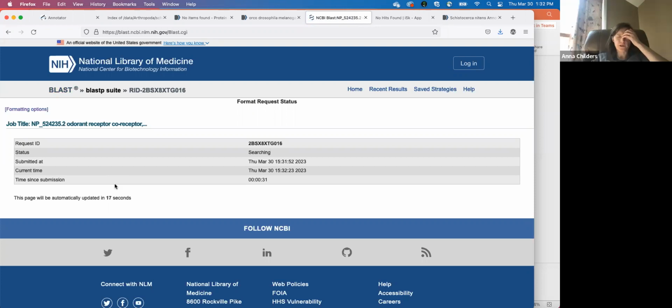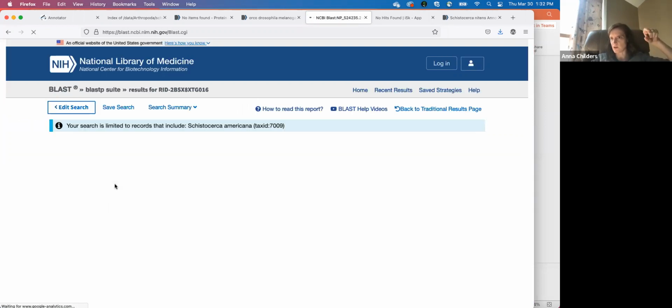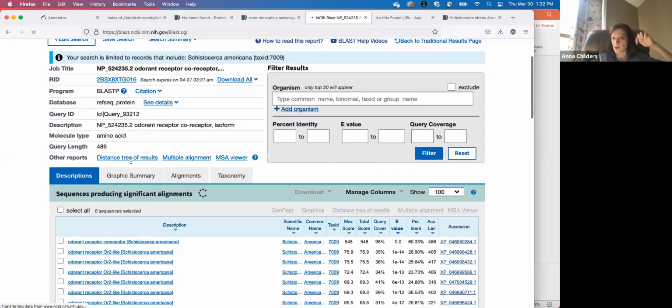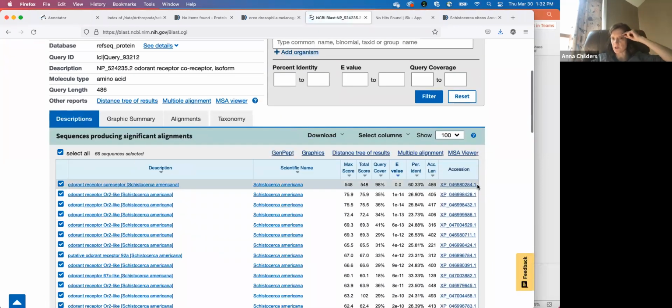So Monica, just to be clear, you're only saying that we can't do it at the I5K workspace because of the fact that it needs to be reset, but after that's reset, we could be doing this there, putting the transcript sequence in at the I5K database blast site, and then doing this search there, and then in the search results, don't you guys have a link that directly opens JBrowse?